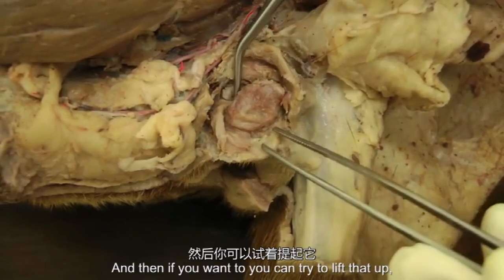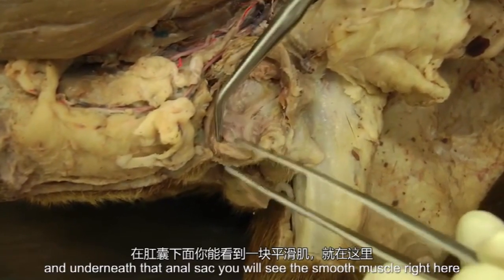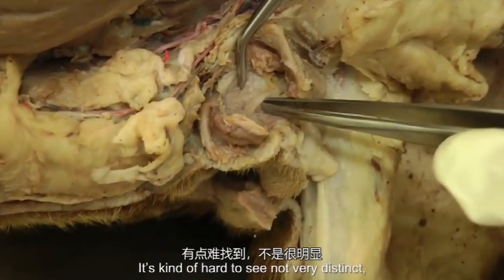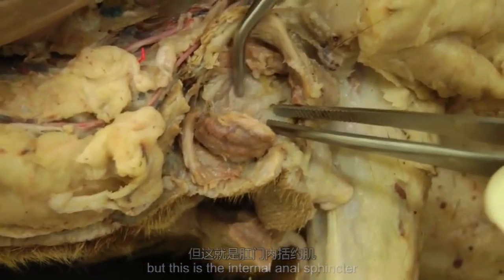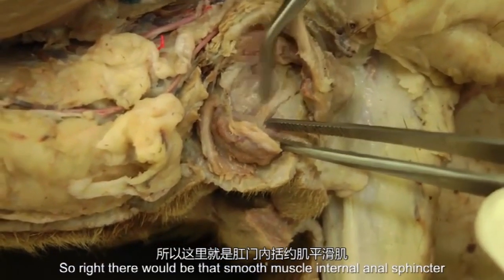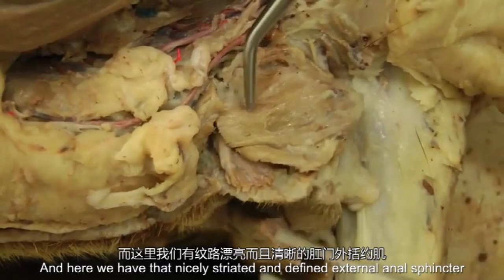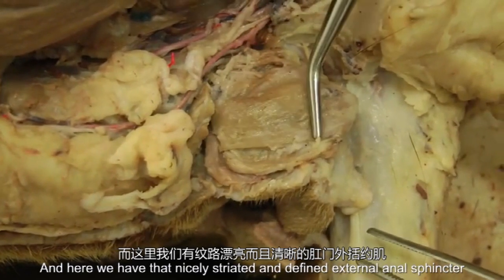And then if you want to, you can try and lift that up. And underneath that anal sac, you'll see this smooth muscle right here. It's kind of hard to see and not very distinct, but this is the internal anal sphincter. So right there would be that smooth muscle, internal anal sphincter. And here we have that nicely striated and defined external anal sphincter.